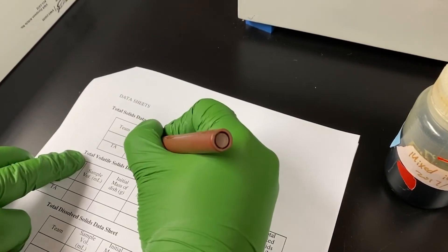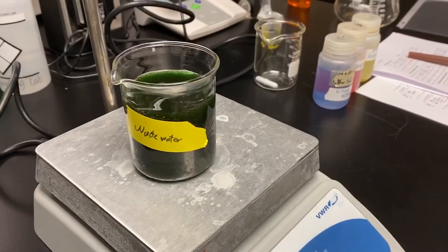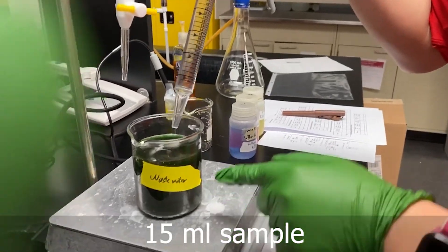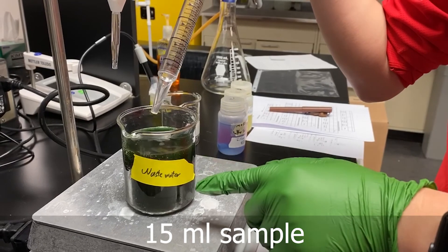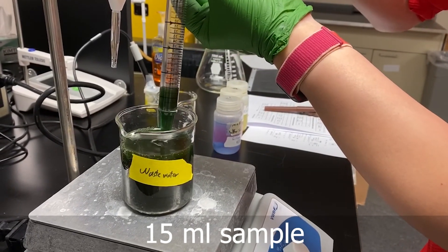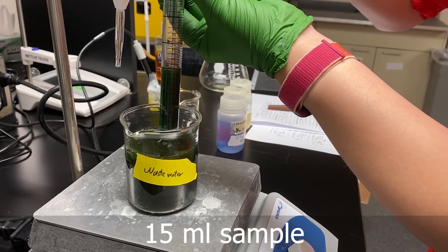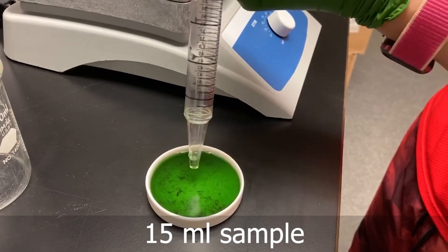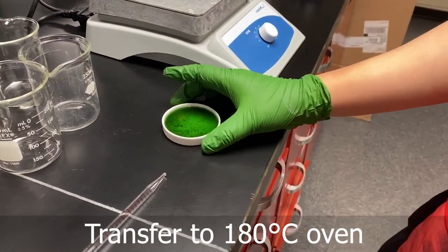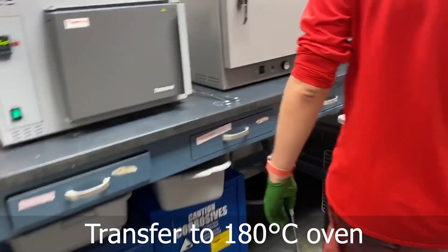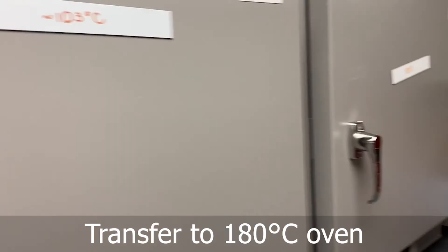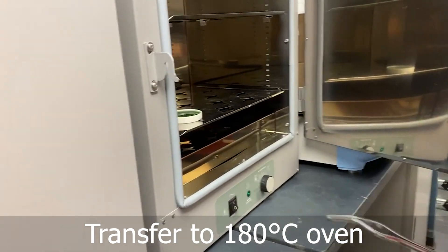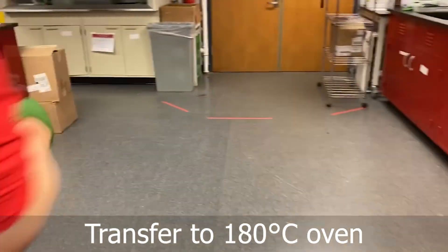And then we are going to take 15 ml of the sample. We need to take 15 ml of the wastewater sample into the dish. Before we take the sample, we need to ensure the sample is mixed. And then we transfer this to 180 degree oven. Then we use the tweezers to put it into the oven and wait for 45 minutes.